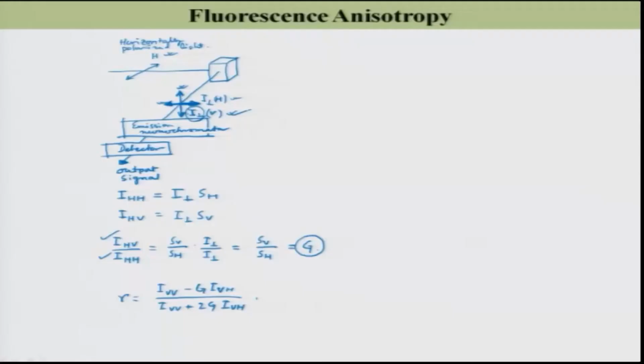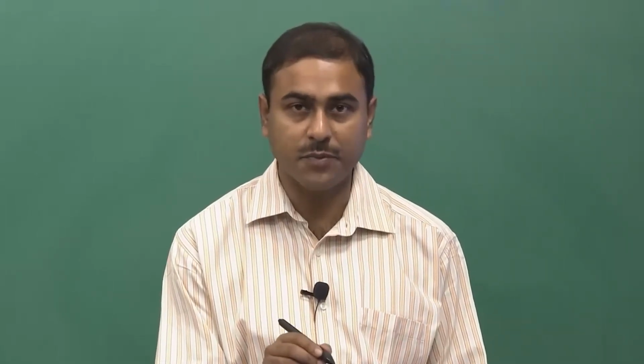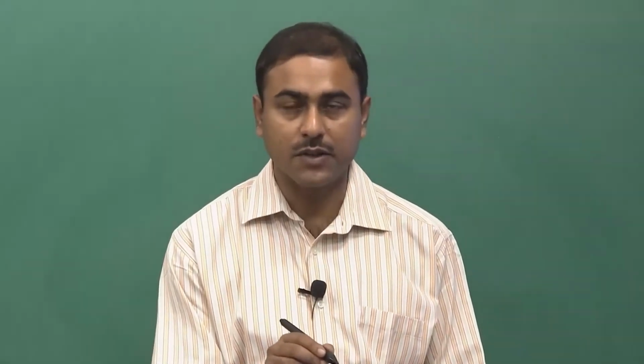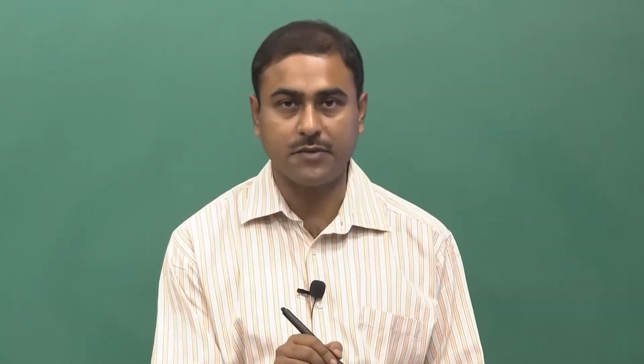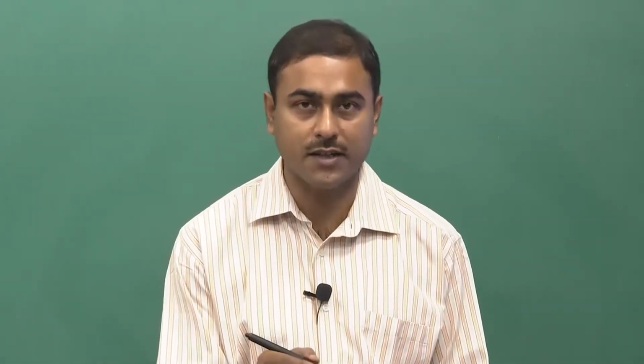Welcome to lecture number 28 is covered above. So, we are discussing fluorescence anisotropy, and as you can see in our previous discussion, what you are going to measure is the intensity in the detector, right. This intensity, the IVH part, should be multiplied with the G factor, which is nothing but the sensitivity of the detector for differently polarized light.